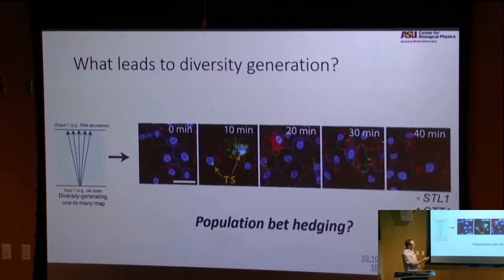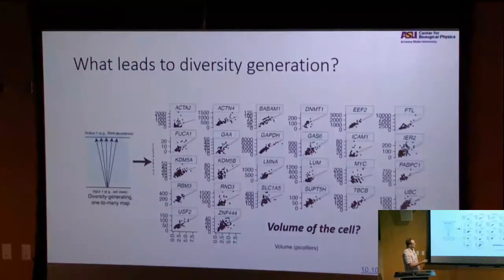So you actually need to design a microscope that is both fast enough and high enough resolution that you can go in and localize each of these diffraction-limited puncta, which, again, are a fluorescent way of imaging these. I'm not going to get too much into biochemistry. I hope you can appreciate this starts to become a lot of data, right? You have to do a lot of imaging, and so having something that's both high throughput and high fidelity is what we really need.